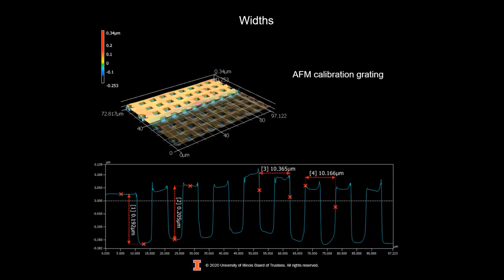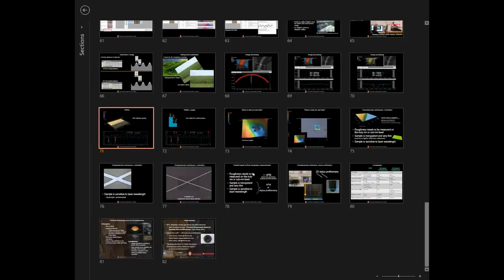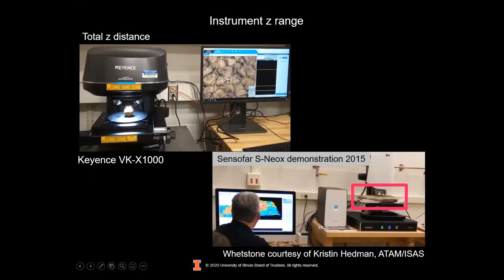Okay. You had shown some significantly sized samples in the 3D optical profiler. Are there any particular issues that you have to deal with as the samples become larger and larger? If your sample is outrageously heavy, then as the stage tries to move the sample, it might not move quite as smoothly.